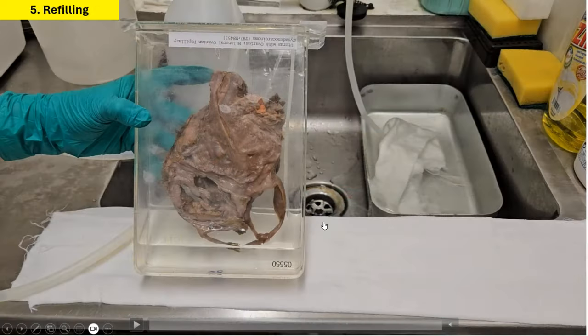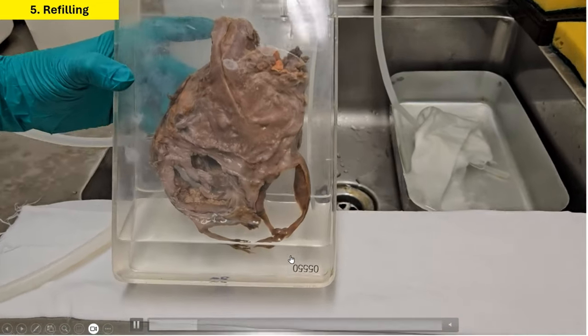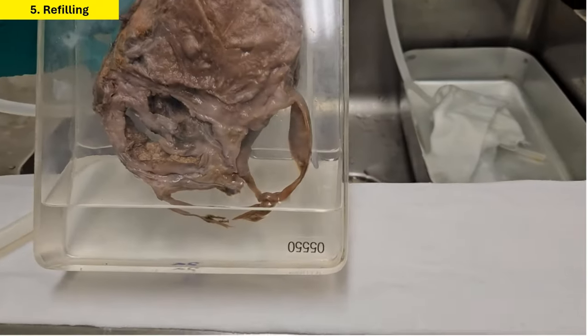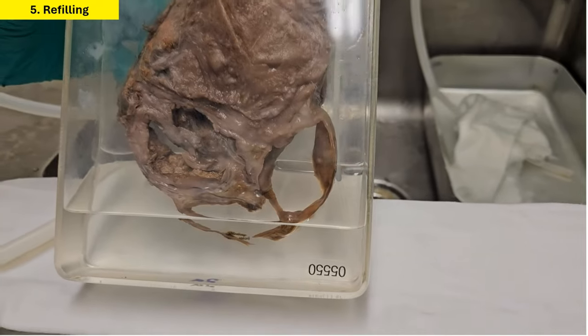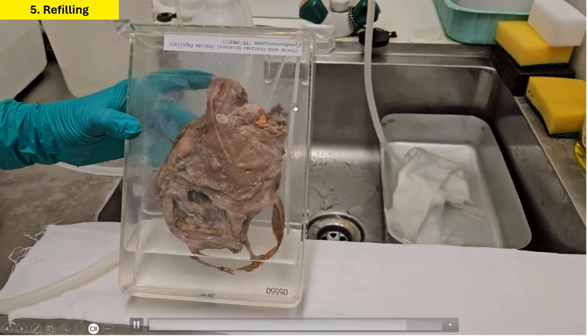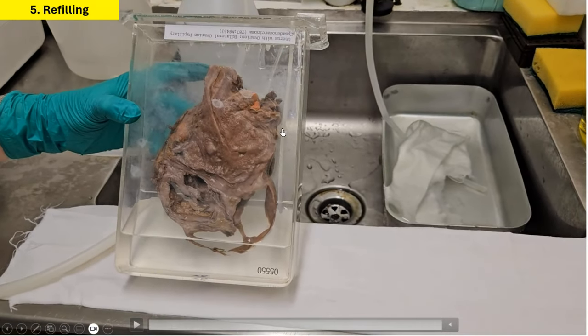When we are sure that we have done sufficient rounds of cleaning, we can then refill the specimen container with a fresh batch of preservative fluid. We generally do not fill it all the way to the top, but close to the top so that it just covers the specimen. This allows bubbles to rise to the surface over time.